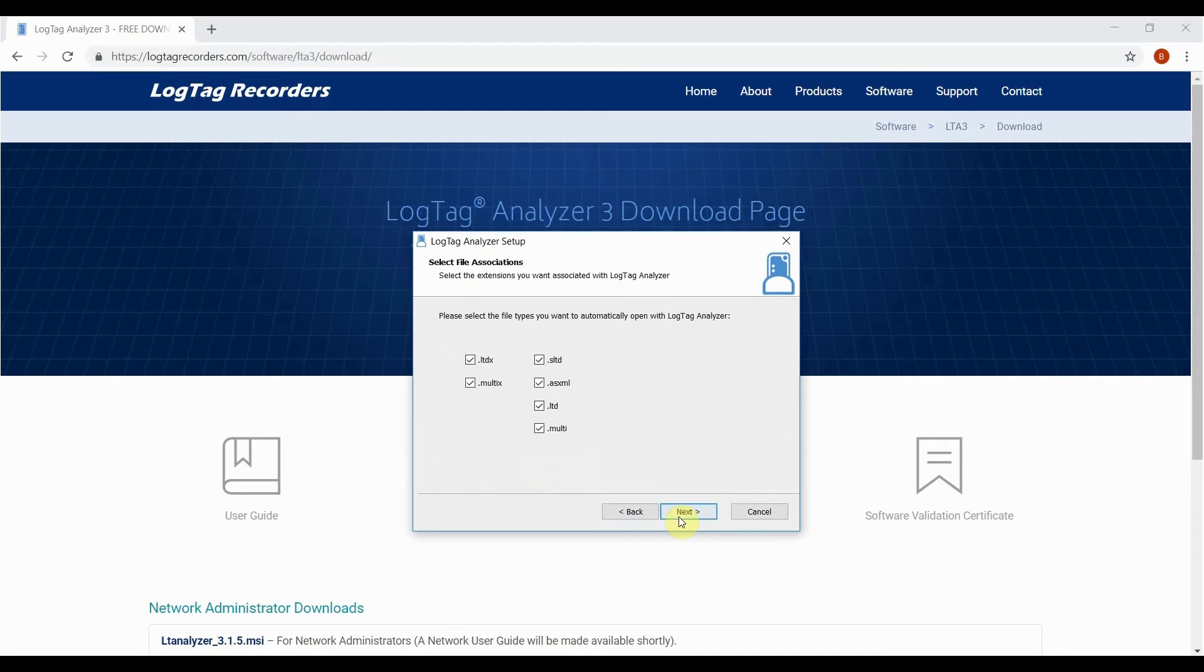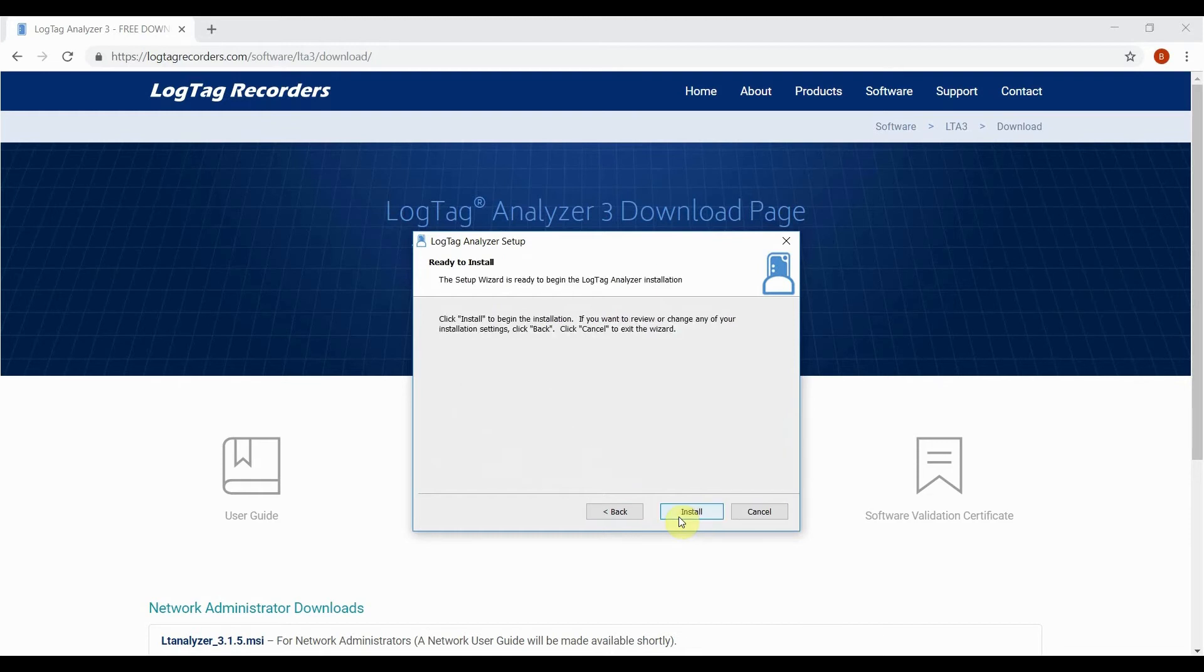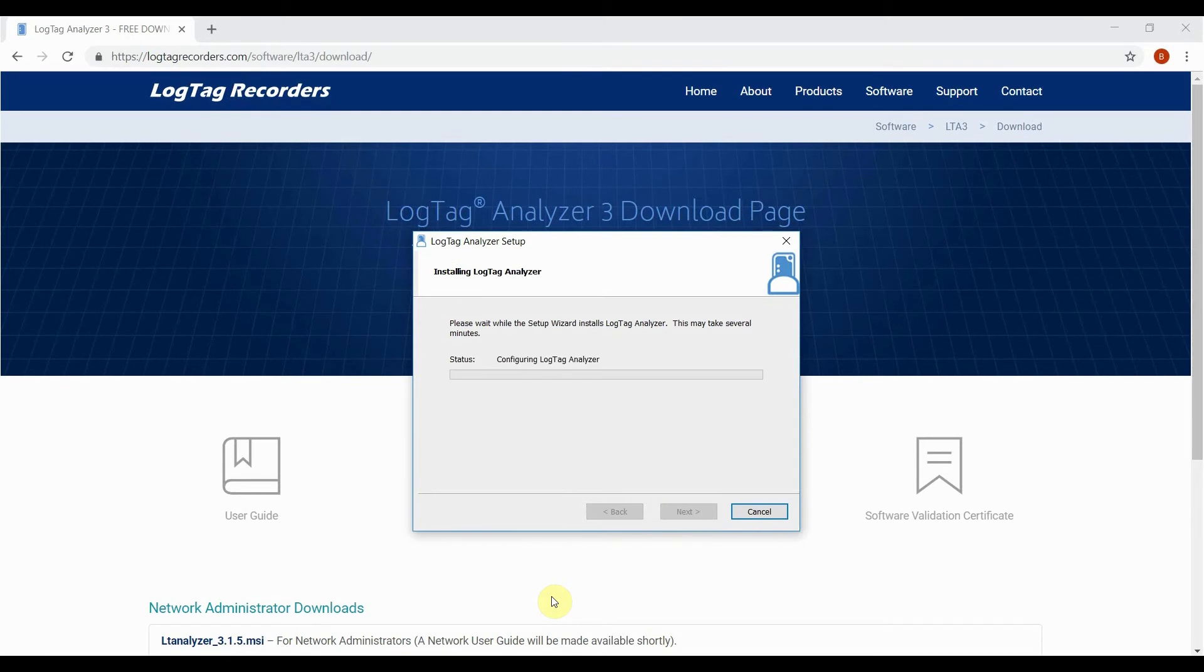We recommend keeping all file extensions ticked as they are only used by LogTag Analyzer. Click next and finally install to commence installation with the settings you've chosen.